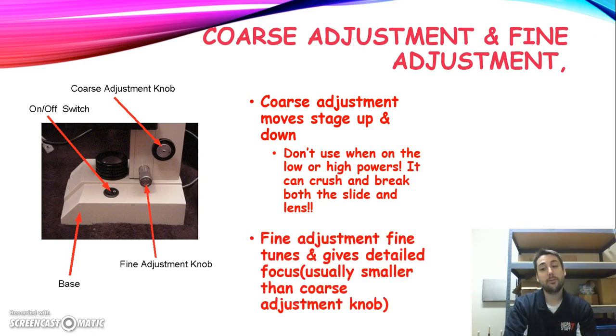What you should use after you focused in on red on the scanning is the fine adjustment. Once you switch to yellow and blue, just use the fine adjustment knob. It actually will make it much, much easier to focus and a lot more clear.